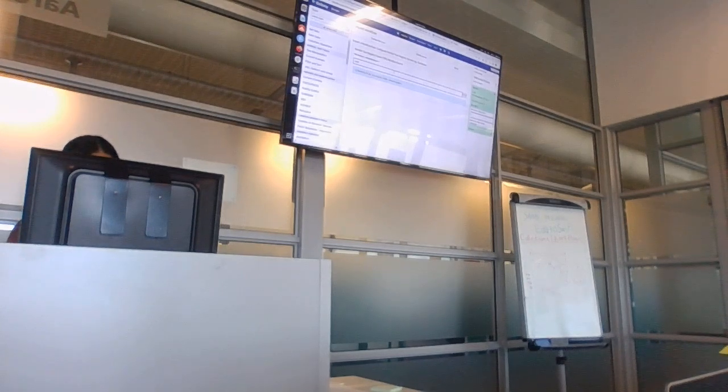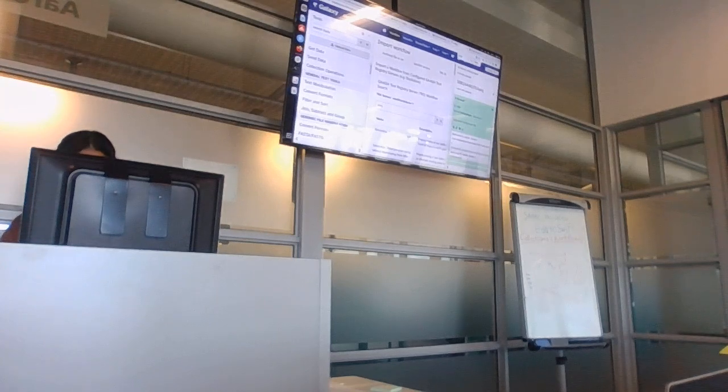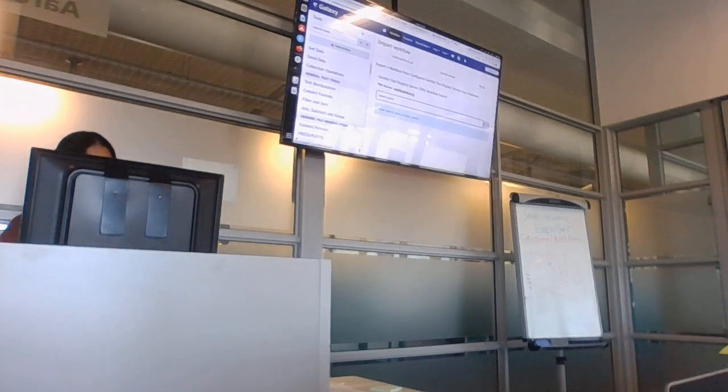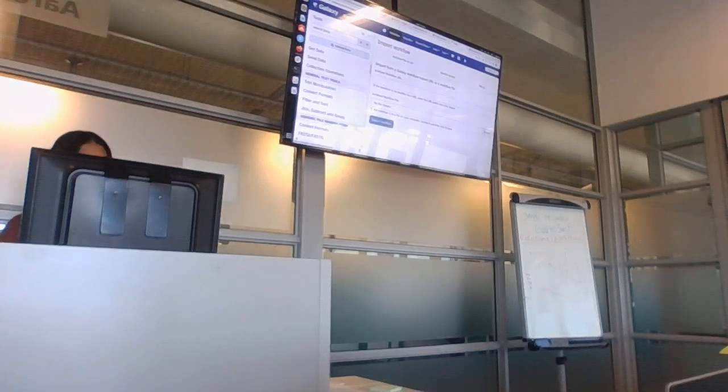For example, there isn't one for cholera. So if you put SARS in there, let me just make this bigger. So there's nothing. I left this on EU. So again, when you click on workflow and you click on import, you're automatically on the archive file or URL.